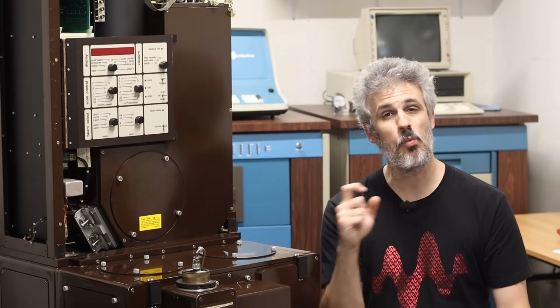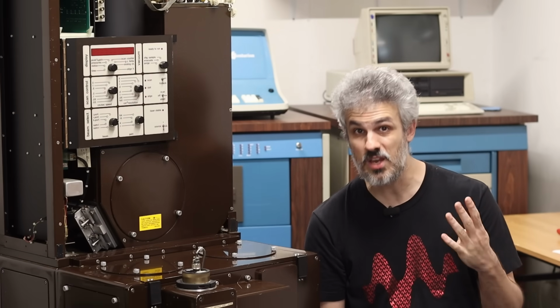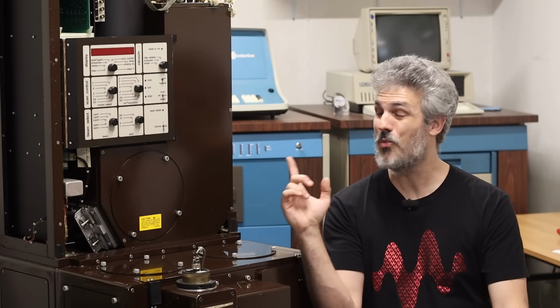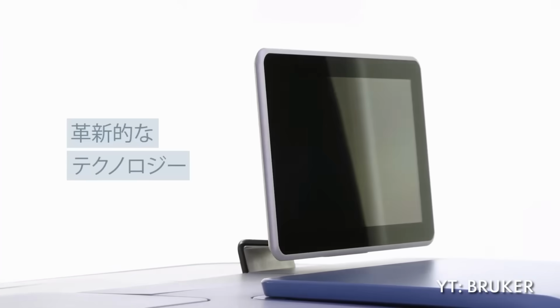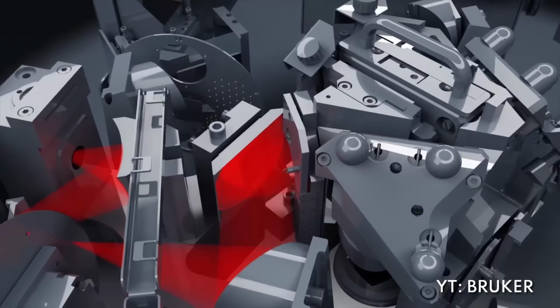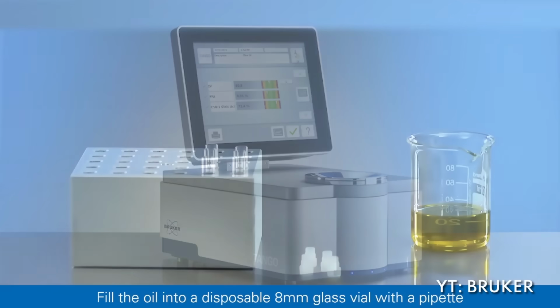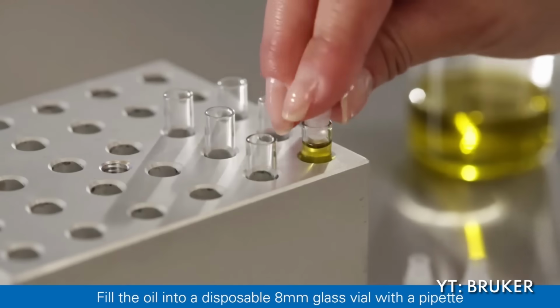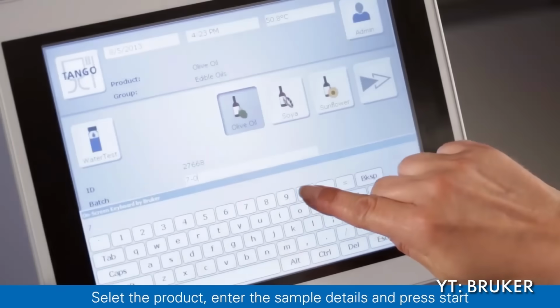Now, when I say that this is still one of the best high-resolution infrared spectrometers that you can find today, 40 years after it was initially built, I'm not saying that as hyperbole or for dramatic effect. This machine really is that good. Now, that's not to say that there haven't been advancements in spectroscopy. Of course there have been. 40 years is a really long time. But it seems that the market has moved away from high resolution into middle and low resolution devices. And this is because, as I understand it, if you're doing wet spectroscopy, like working with oils, the amount of resolution that this thing can pump out is really not all that necessary.